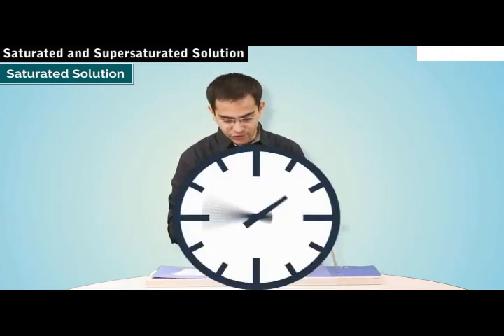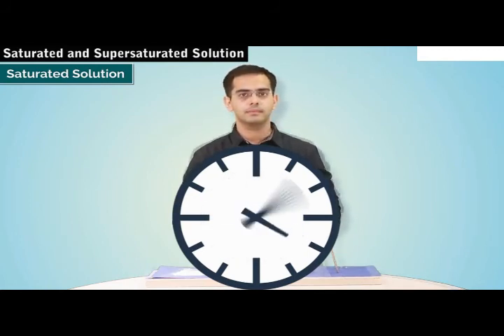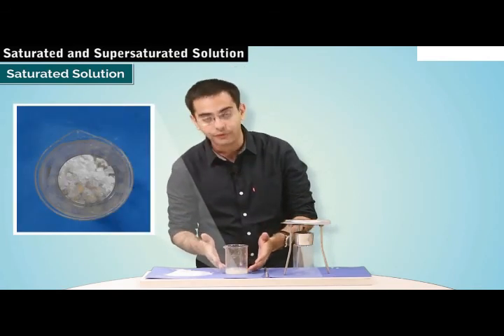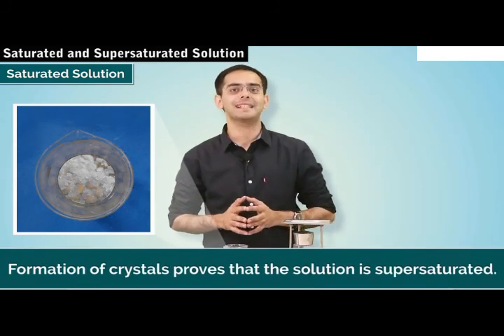And now after adding these crystals to the solution, let's leave it for a couple of days like this. So after a couple of days, here you can observe that adding salt crystals to the supersaturated salt solution causes the excess salt to begin forming crystals. And these salt crystals settle down at the bottom of the beaker. So formation of crystals proves that the solution is supersaturated.